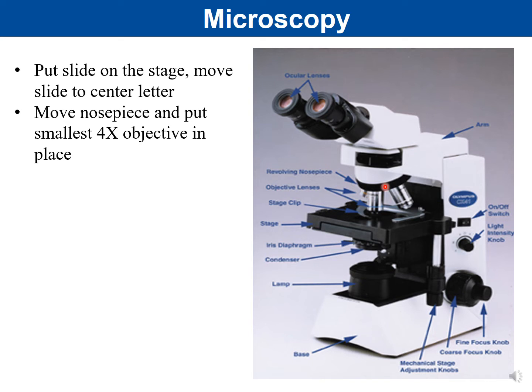And so that's how we would always start. The 4x lens you're going to see in a minute is called the scanning lens. It's the one that we start with to try and find our image.